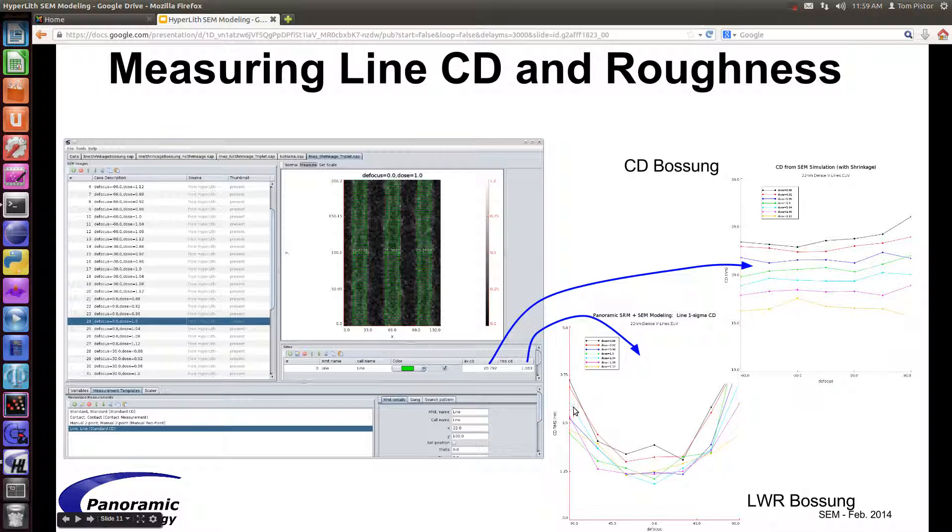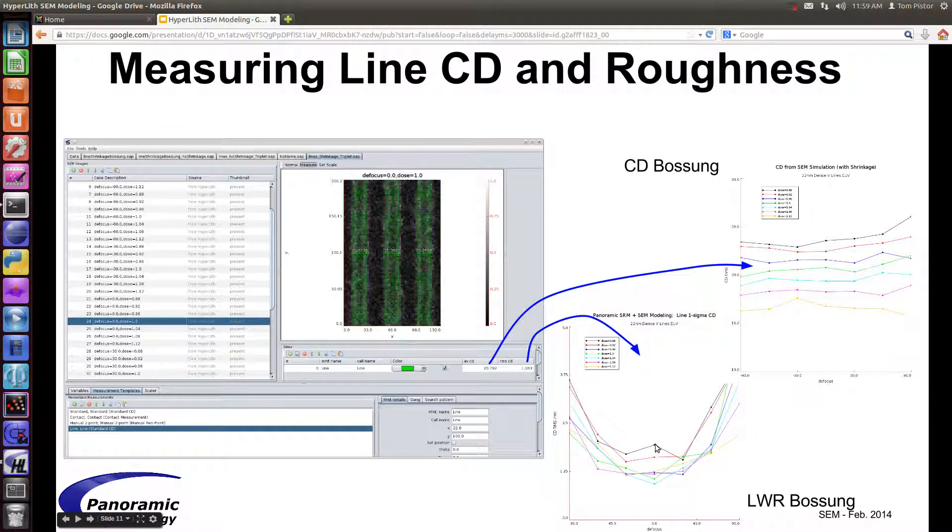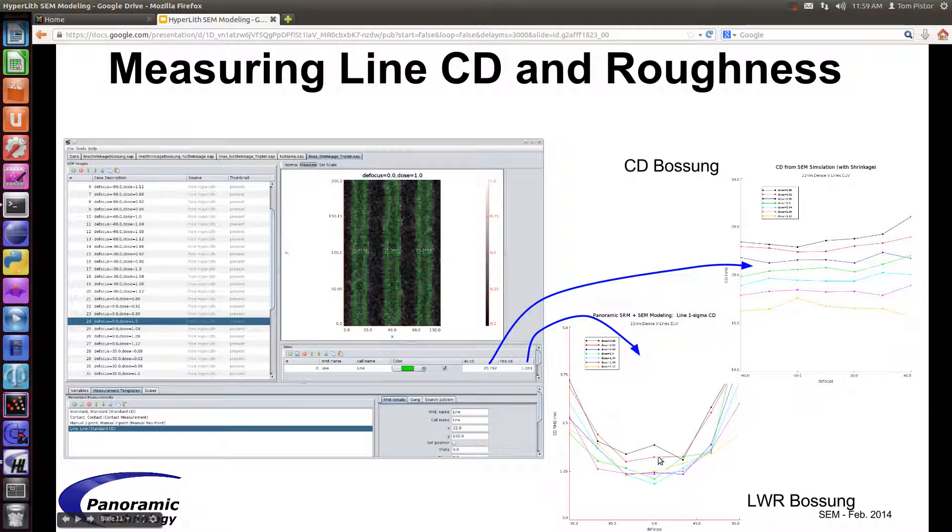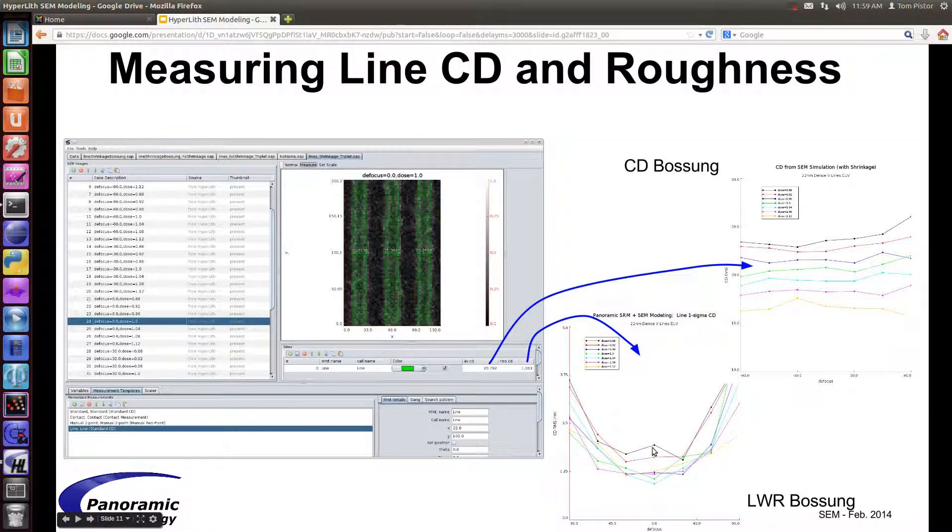So you can see at best focus, you have the lowest LWR, and out of focus, you have a higher LWR. Also, for the higher dose, the LWR goes down. In the lower dose, the LWR goes up.